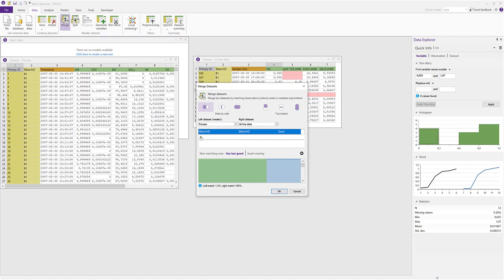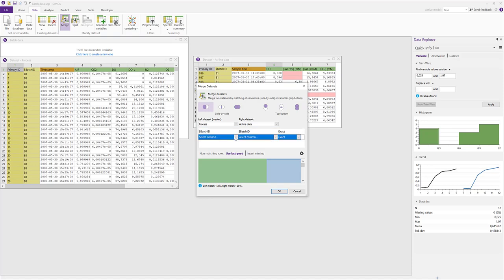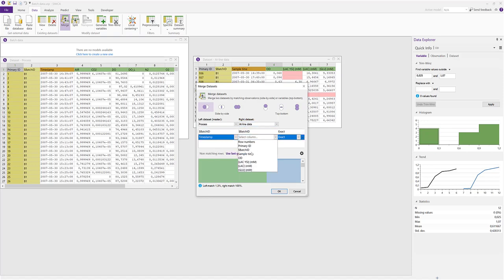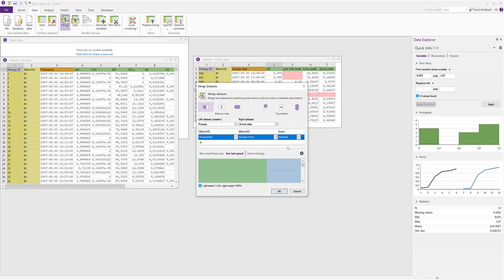In our case, we want to match on time, so from the process data set I select the timestamp. From the at-line data I select the sample time, but we don't want to use exact matching since we don't have perfectly matching timestamps. This can be seen in the visualization below where we don't have any blue rows and we can see that it says zero percent match. Instead, we can choose to match the at-line data to the nearest process data time point, which is now indicated by the darker blue lines.